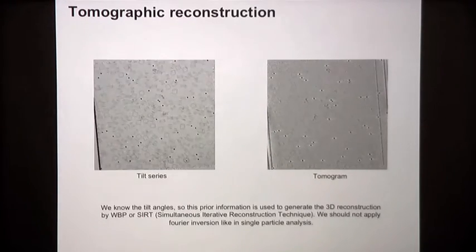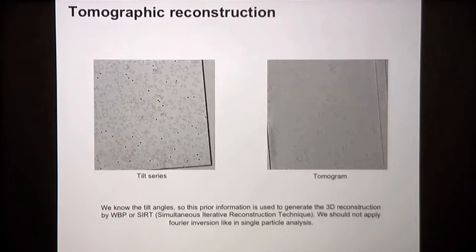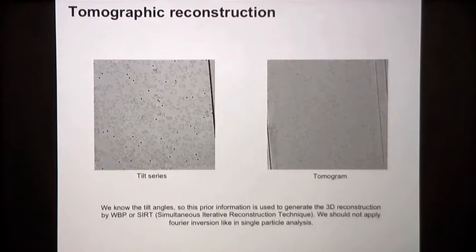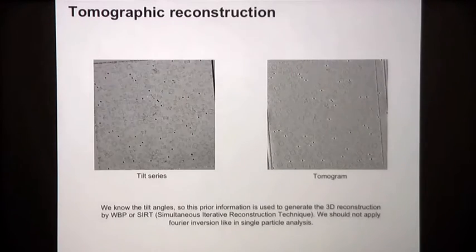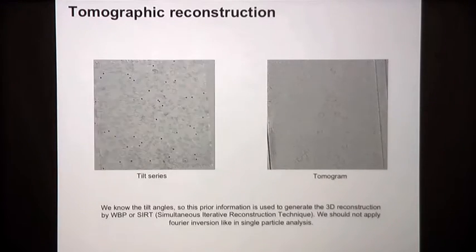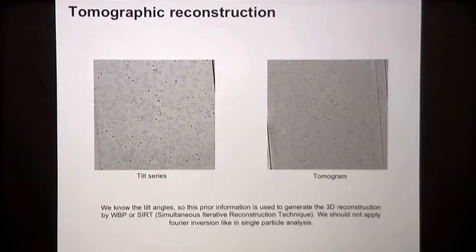Another method to do tomographic reconstruction is SIRT. It's like weighted back projection in real space, but it's based on an iterative procedure where we compare the projections of the density with the original projections, and this way we can improve the reconstruction.